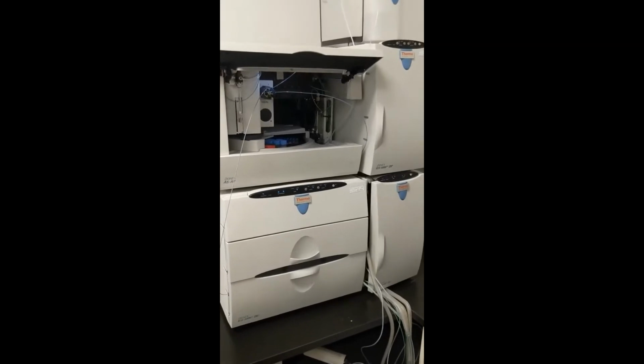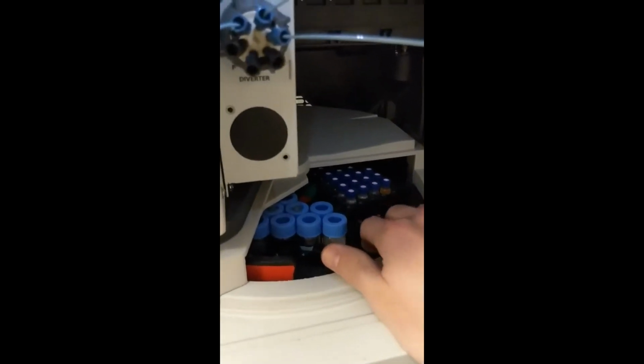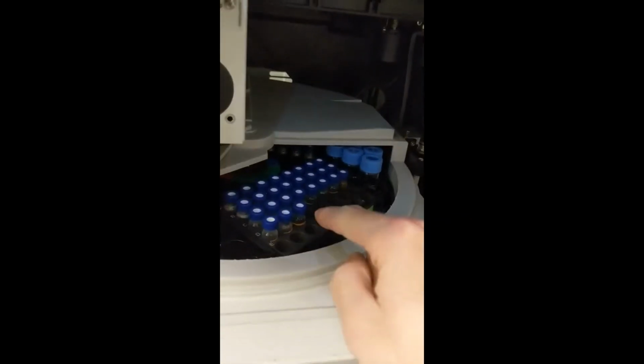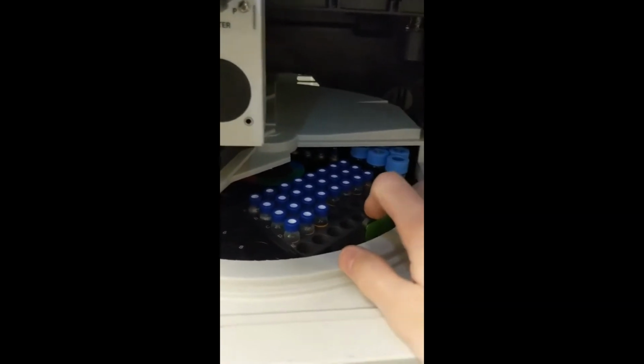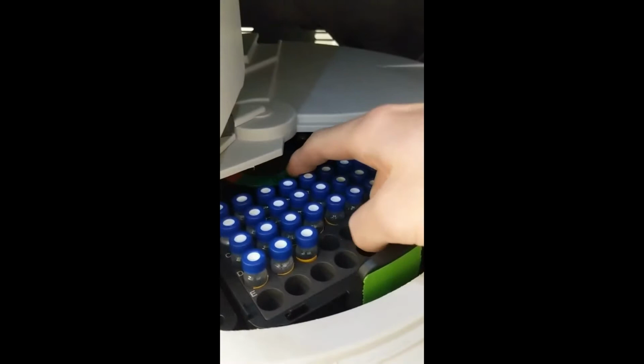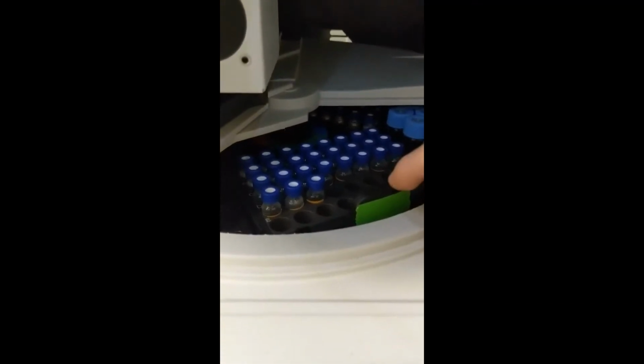Alright, this right here is the autosampler, and we're going to take a look inside. You can see that there are these different trays, and it spins around, and the needle right here can pick out of any of these samples in each tray. You can see that the trays have different colors. The color is back here: you can see the green, blue, and red. And we put tape on the front of these so that we know which tray goes where.